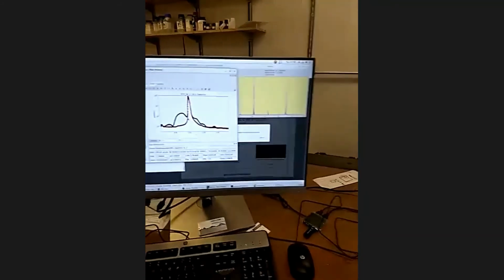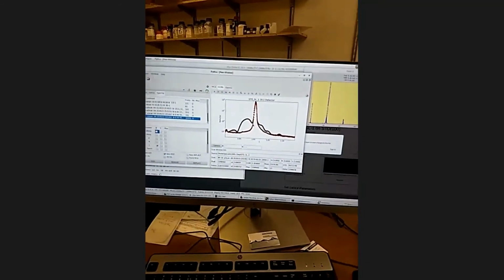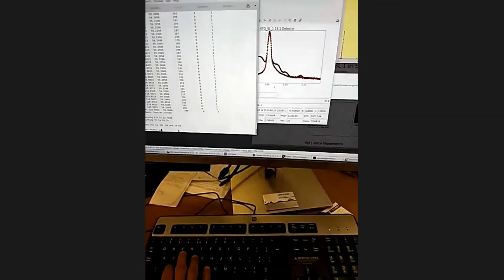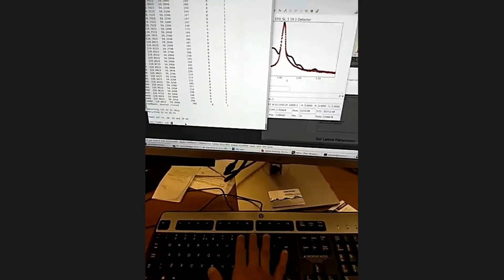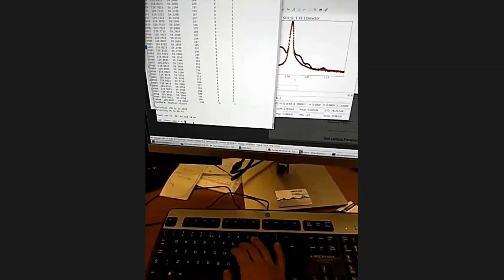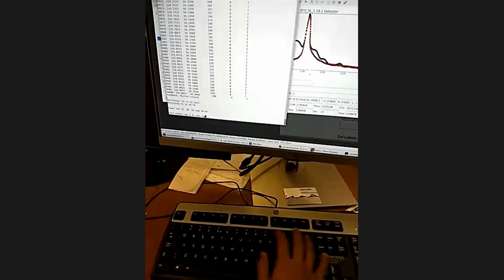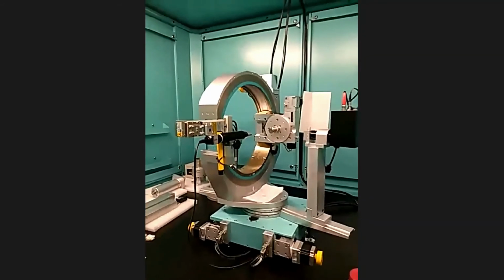Okay, do you have any questions? Oh, I guess it started to listen to me. So this is how the whole thing moves.